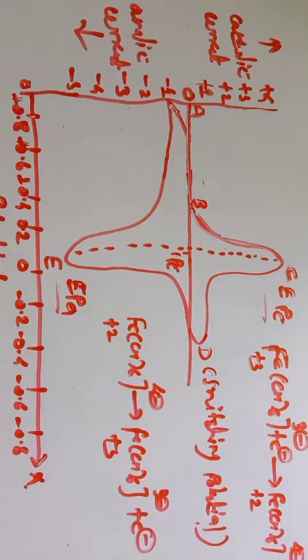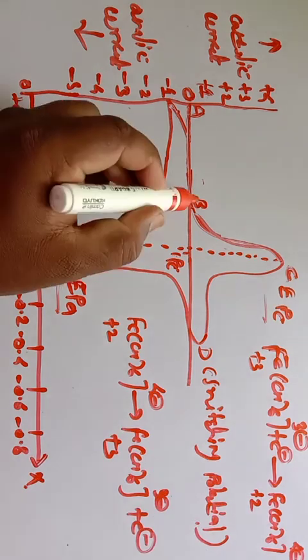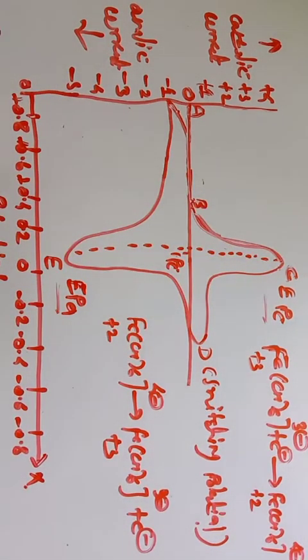As there is a reduction of this Fe plus 3, ferricyanide, to ferrocyanide, there is a rapid increase in the current due to the decrease in concentration of this ferricyanide. As the concentration of ferricyanide decreases, meaning it undergoes the reduction reaction, the current is more and more, and therefore a rapid increase in the current occurs from point B to C.